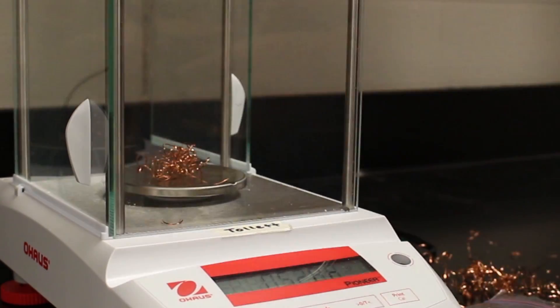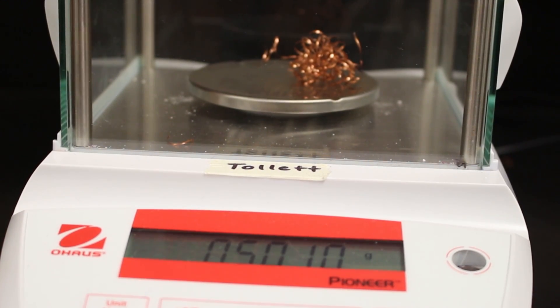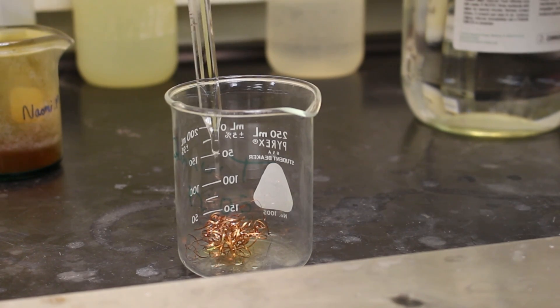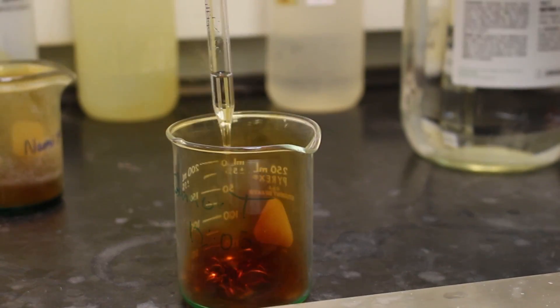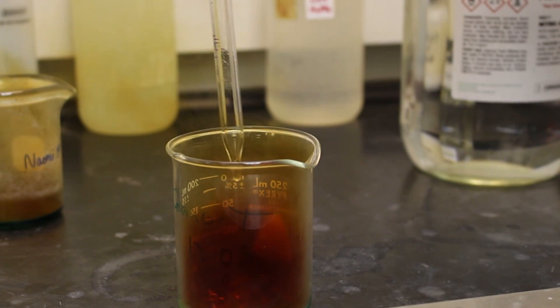We measured approximately half a gram of copper turnings. We put the copper in a 250 milliliter beaker and added 5 milliliters of concentrated nitric acid.